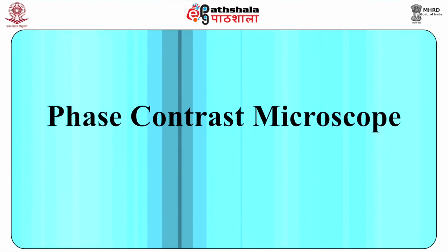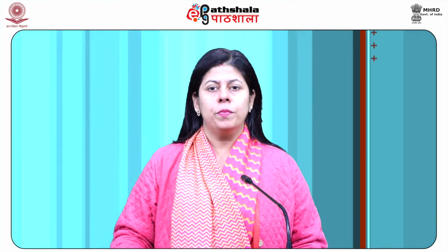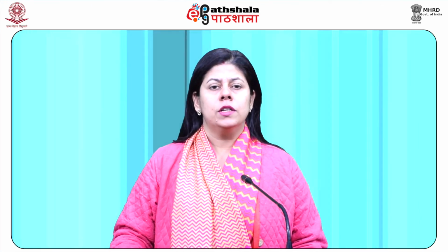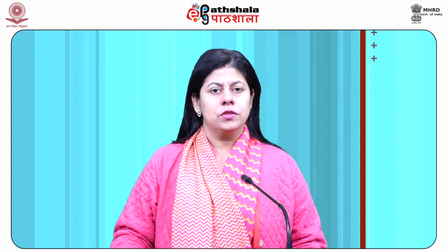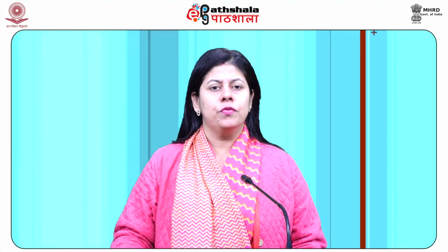Phase contrast microscope. Phase contrast microscopy is an optical microscopy illumination technique in which small phase shifts in the light passing through a transparent specimen are converted into amplitude or contrast changes in the image. A phase contrast microscope does not require staining to view the slide.